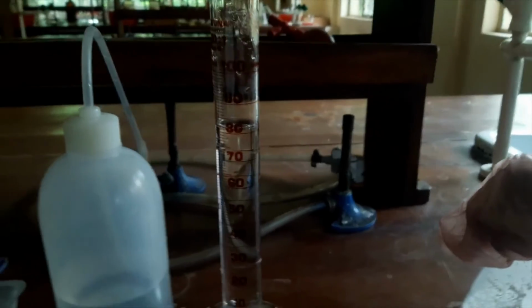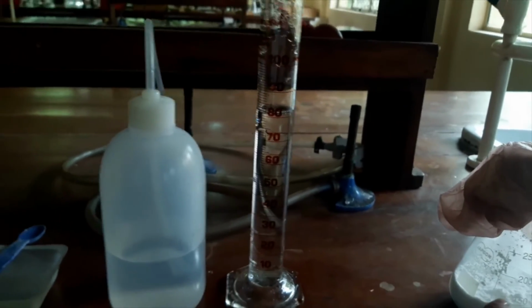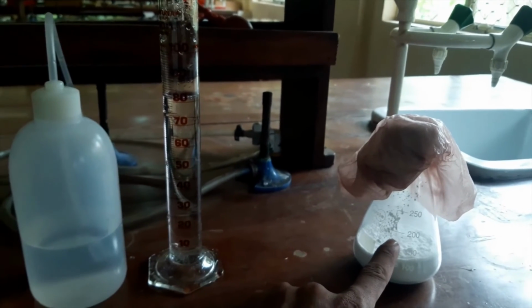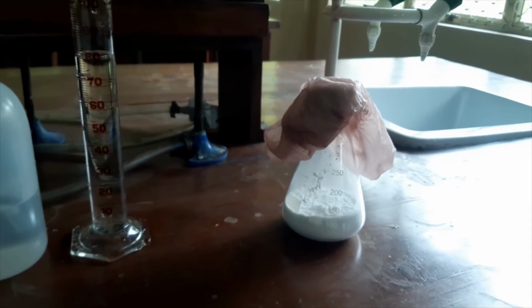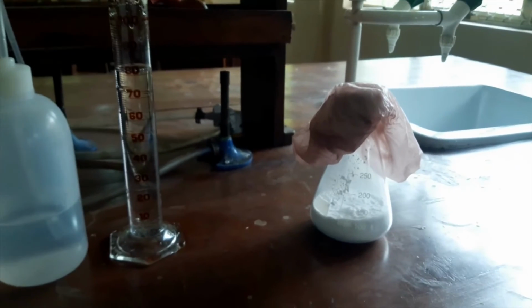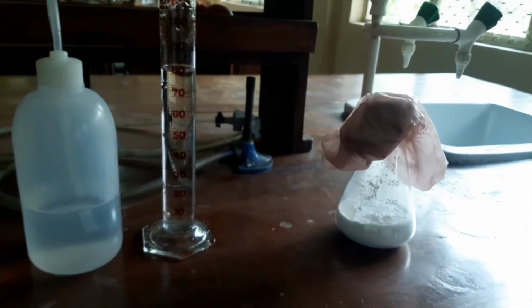Here I have 80 milliliters of distilled water. I will add the 80 milliliters of distilled water into this conical flask, and I will mix it very well. After that, the resulting paste I will add to the TLC plate, and I will prepare or spread TLCs. After that we can dry. You can see that also. Please wait until I start the work.